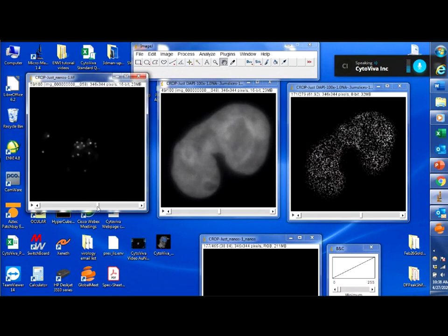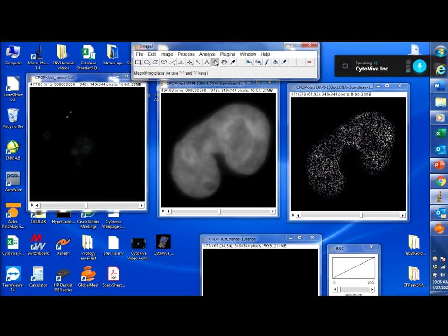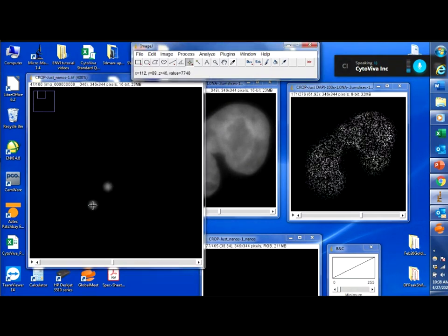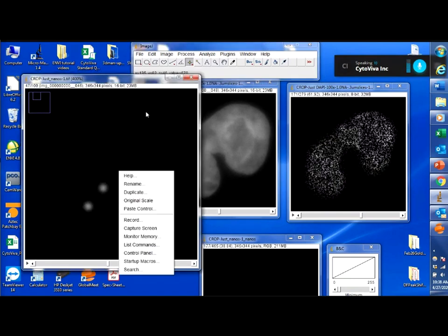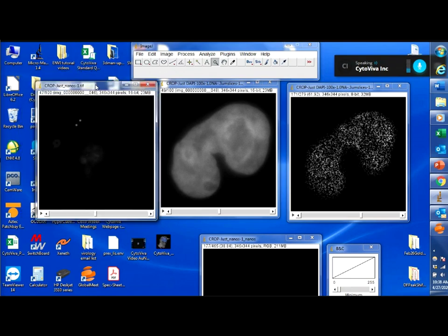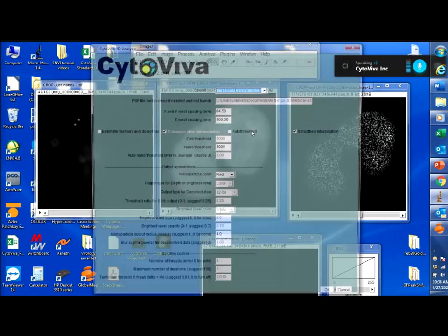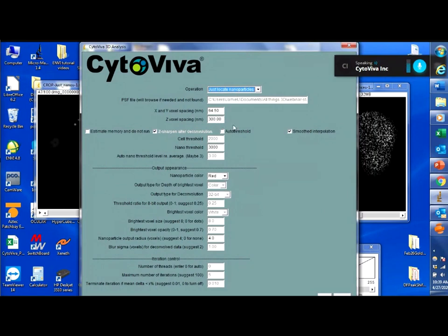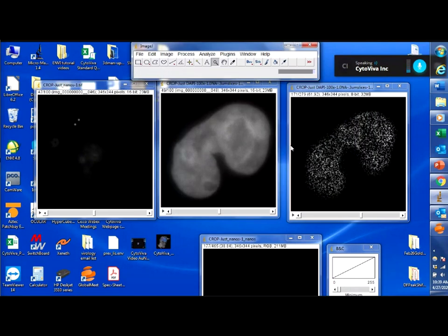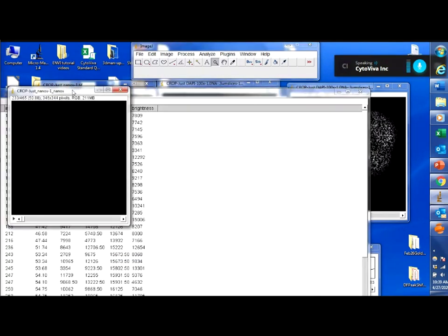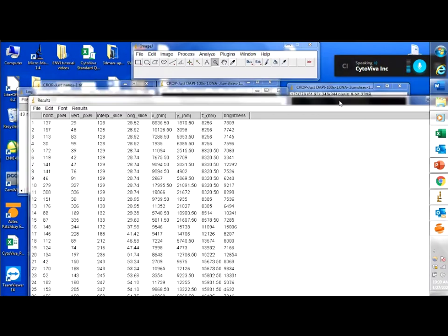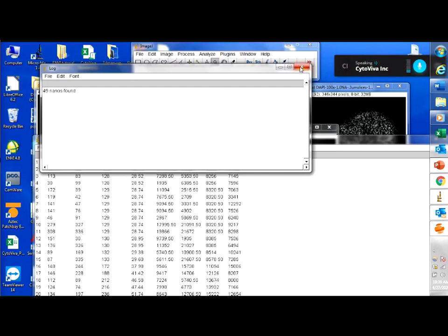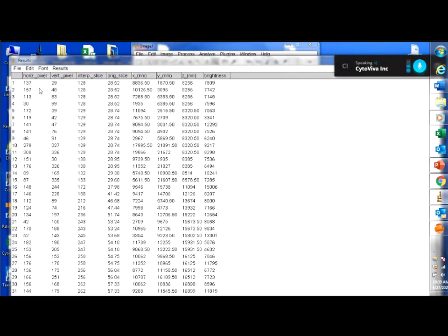You go through the stack and find particles that may not be as bright as others, see their intensity value, and set a threshold for how bright an object must be to be counted as a nanoparticle — for example, 5,000 or 7,000 intensity units. Then you run the locate nanoparticle routine. For this example, we entered a 300-nanometer (0.3-micron) Z spacing as the acquisition parameter. It runs through all 100 slices and produces a table. The log shows it found 49 nanoparticles, giving detail about the brightness of each one, which plane it was on, its X and Y coordinates, and the original slice along with the interpolated slice.